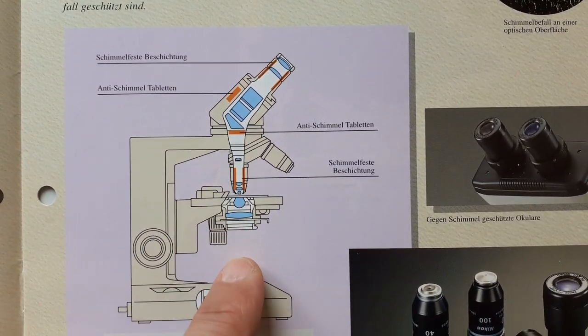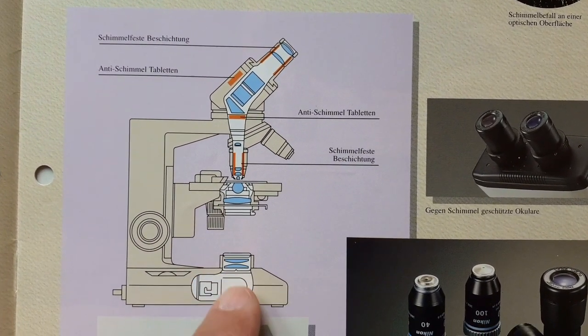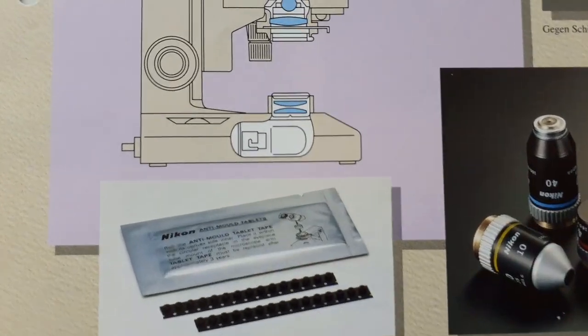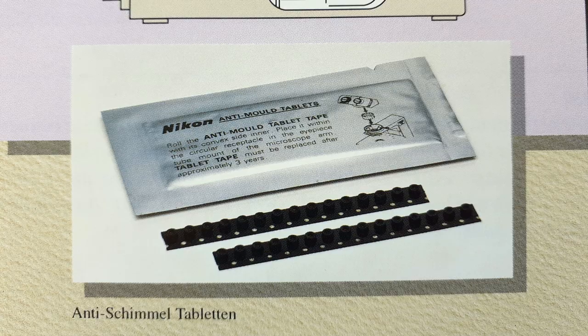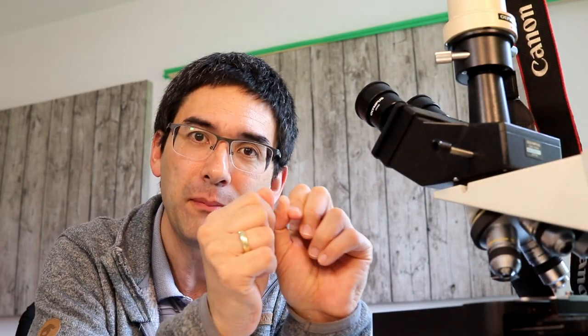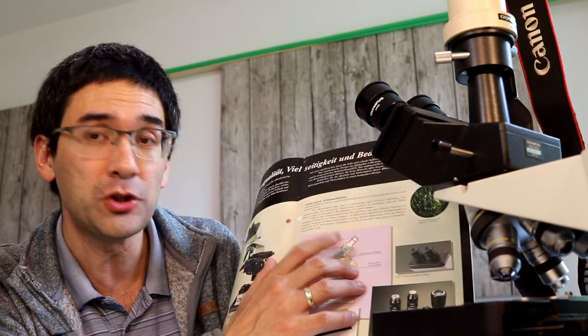The other thing is they were actually selling anti-fungus tablets. These are basically sticky strips, and what you do is there are places in the microscope where you have to stick them in, and this releases some kind of a chemical to reduce the fungal growth inside the microscope. They actually say here that after three years you have to replace that.